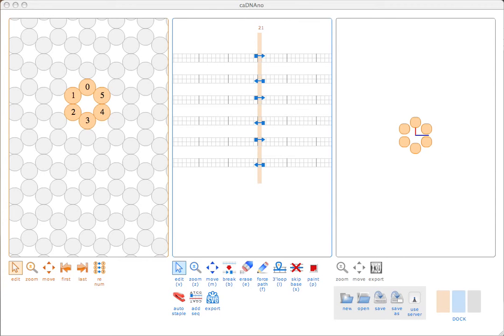The leftmost panel is what we call the slice panel. In our honeycomb lattice abstraction, the helical axis of each strand runs parallel to the z-axis in 3D space, so the slice panel is a fixed view of the x-y-plane. Basically, you're looking down the ends of the helices. The slice panel is used to choose which helices you want included in your structure.